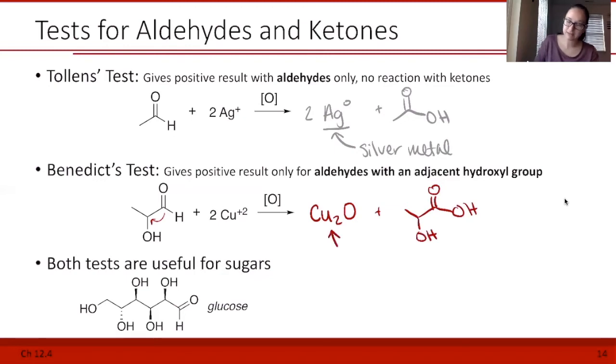And a positive test would be a brick red solid. Copper oxide is often the color of bricks.